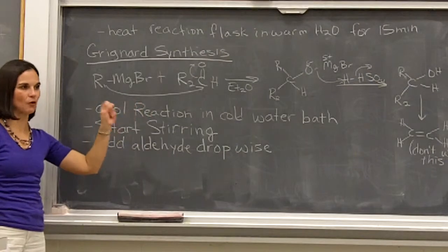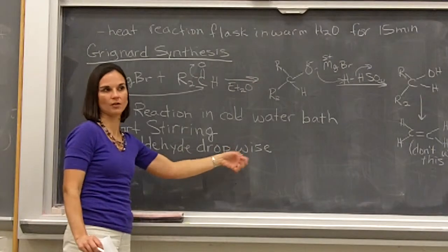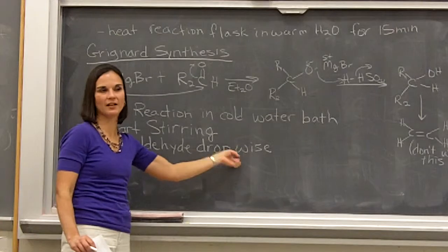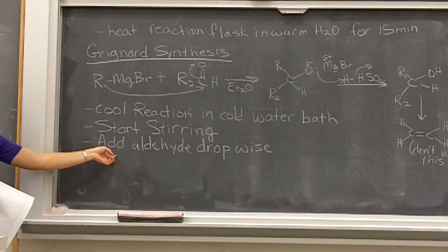just making these spurting noises. That is the reaction taking place. So don't be surprised if all of a sudden your reaction starts talking to you, okay? Some of them, depending on the combination, will actually make this spurting noise. But do control this addition. We are adding it dropwise, okay?